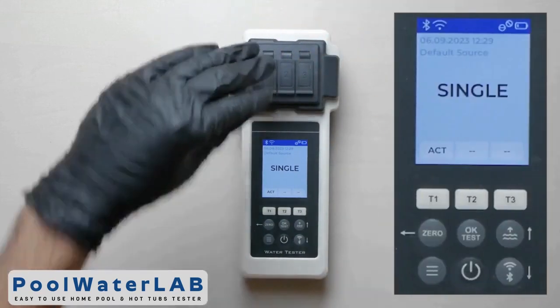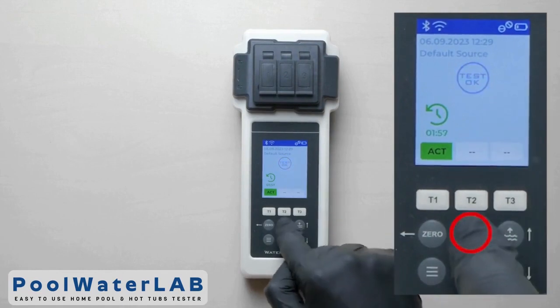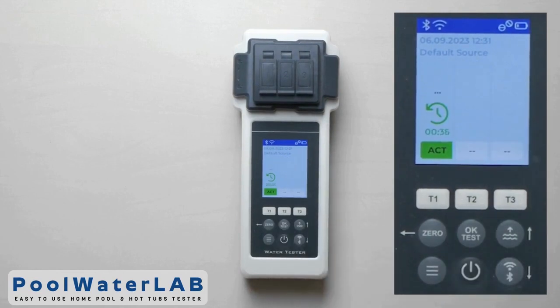Cover the measuring chamber with a light protection cap and press the one button to start the countdown. Press the OK button and wait until the countdown ends and the test results appear.